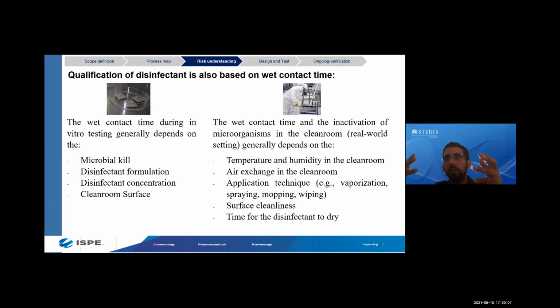And in this phase 3, when you do it in the field, the goal is to look at how the variables differ from the clean room. So the temperature, the humidity, the air exchange, the application technique, and the surface cleanliness will affect the efficacy of your disinfecting agent, and whether the validated wet contact time is enough for the field validation. It is important, therefore, to make sure that during your application in the field, in routine, you are respecting the validated wet contact time.